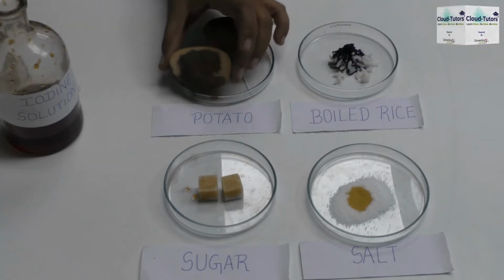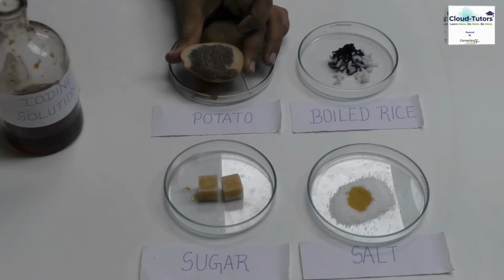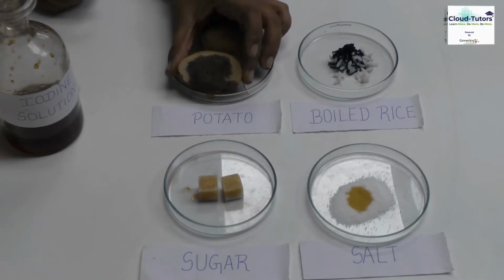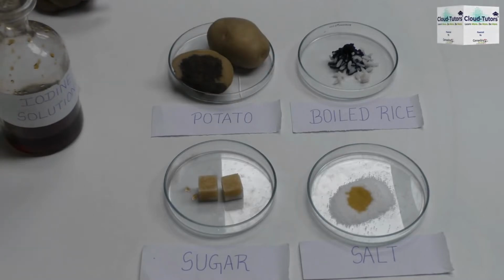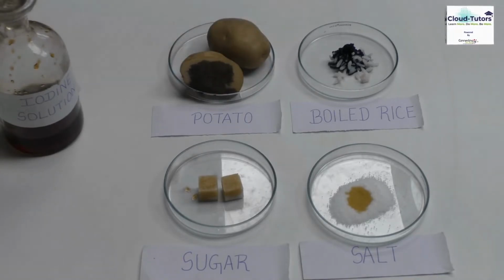Whereas the potato on the other hand is taking a little bit of time because this is raw potato. If we had taken a boiled potato, the result would have been even more evident. So we can see that potato and boiled rice have taken the stain, whereas sugar and salt crystals have not taken it.